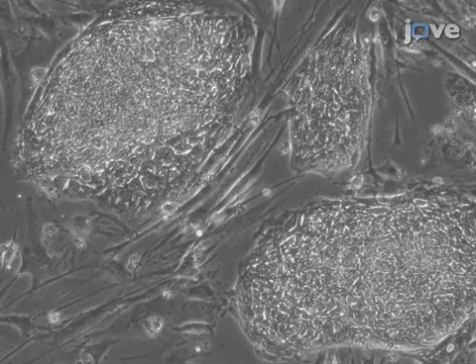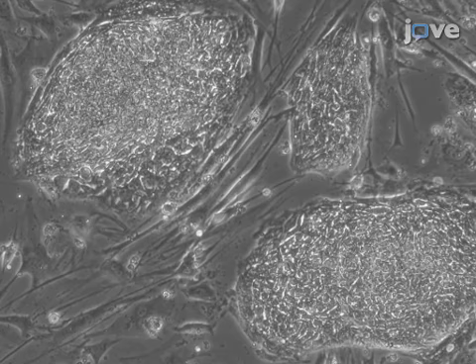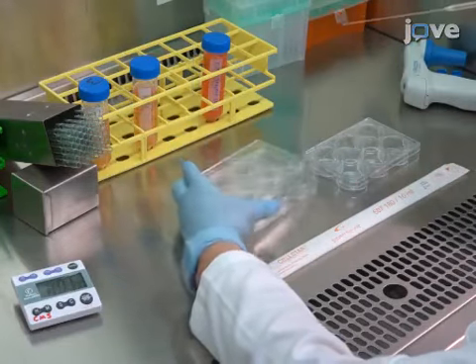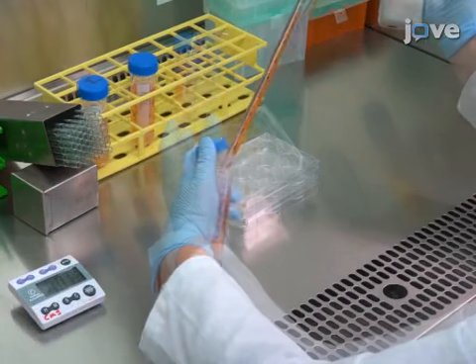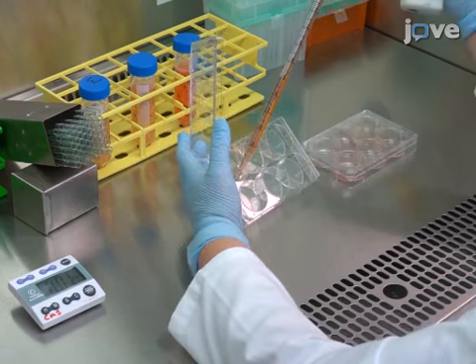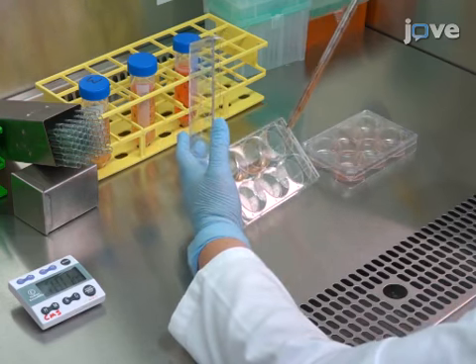To begin the protocol, obtain previously prepared human pluripotent stem cell lines, or hPSCs, grown on mouse embryonic fibroblasts, or MEFs, to 70 to 80% confluency in a 37 degrees Celsius incubator with 5% CO2. Aspirate the hPSC media and add 1 milliliter of 37 degrees Celsius 0.25% trypsin EDTA to each well for 1 minute.